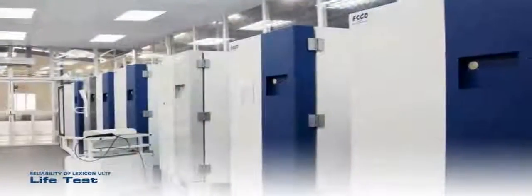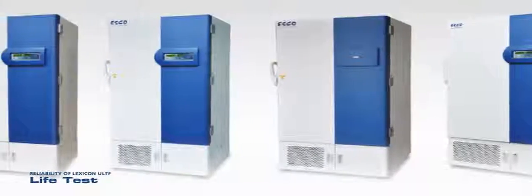In total, there are 34 units that have undergone life tests of 40 degrees to 43 degrees Celsius in a controlled room for at least 6 months to ensure reliability of the Esco ULT freezer.